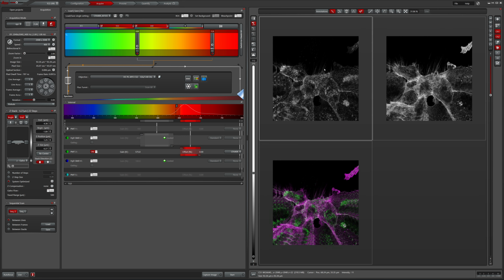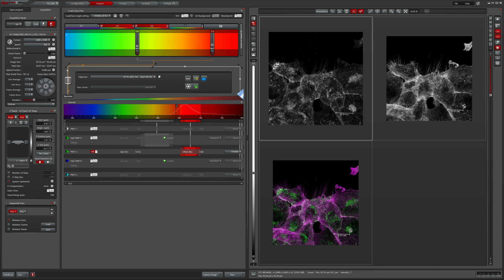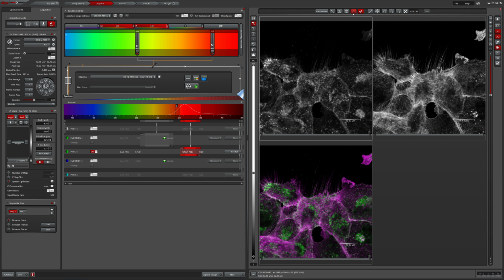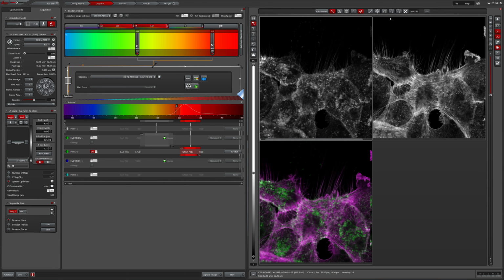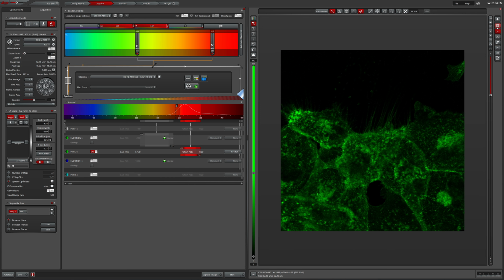If you wanted to kind of get a scale bar, you could, just to get a sense of how large things are, you could left click on this draw scale bar and then draw it there. So I'm going to hit select all and get rid of that. Other useful things, these navigational tools. So I'm going to go back to just the one per image.